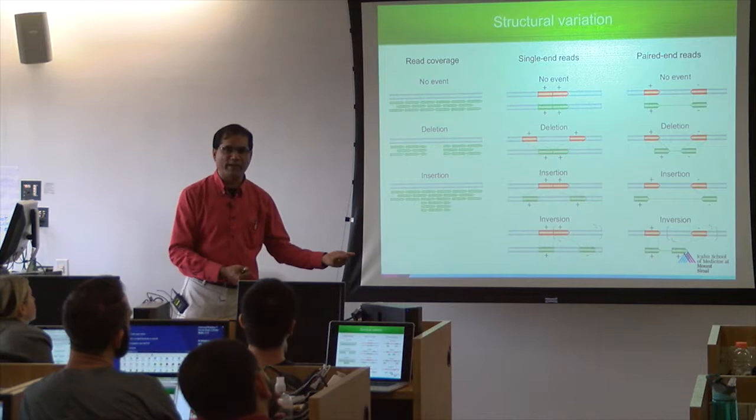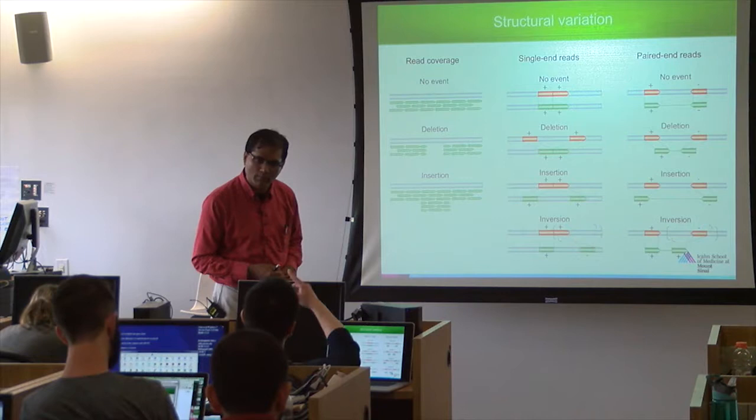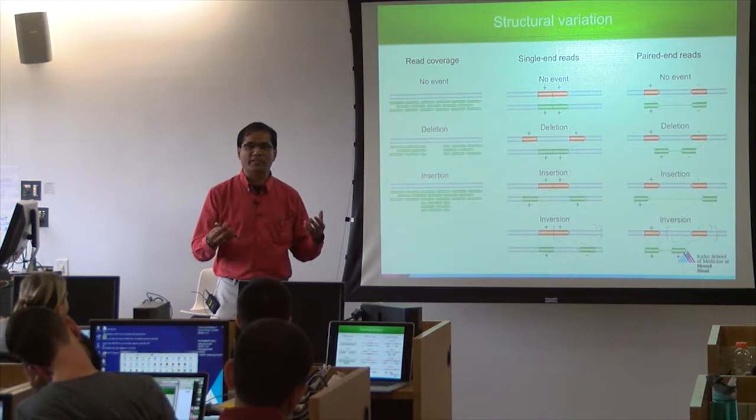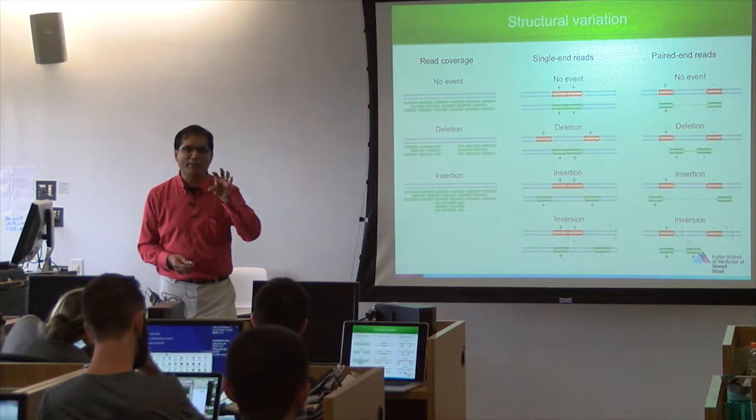Yes? For the reference based approach, you cannot detect insertion. Because we're mapping to the reference genome, your reads cannot map to it. That is why the reference genome is a problem, because you have to do de novo assembly for that. That's a little bit deeper. I was giving only the basic concept of how you do analysis and what kind of information you get from analysis.